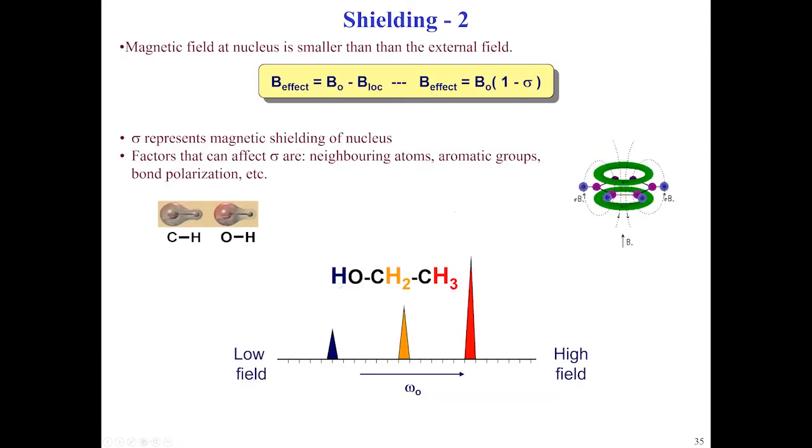And that's the beauty, right? If you're looking at an ethanol molecule, you have a signal for CH3, a signal for CH2, and a signal for the OH group. And chemists have developed all sorts of models and methods to explain this. The oxygen will pull electrons from the hydrogen, so it's less electron rich in comparison to CH. And that's why we get this move to low field, we say, and the other way around. And there are many, many more. You have an aromatic ring in a molecule, and of course that will again create certain different things.